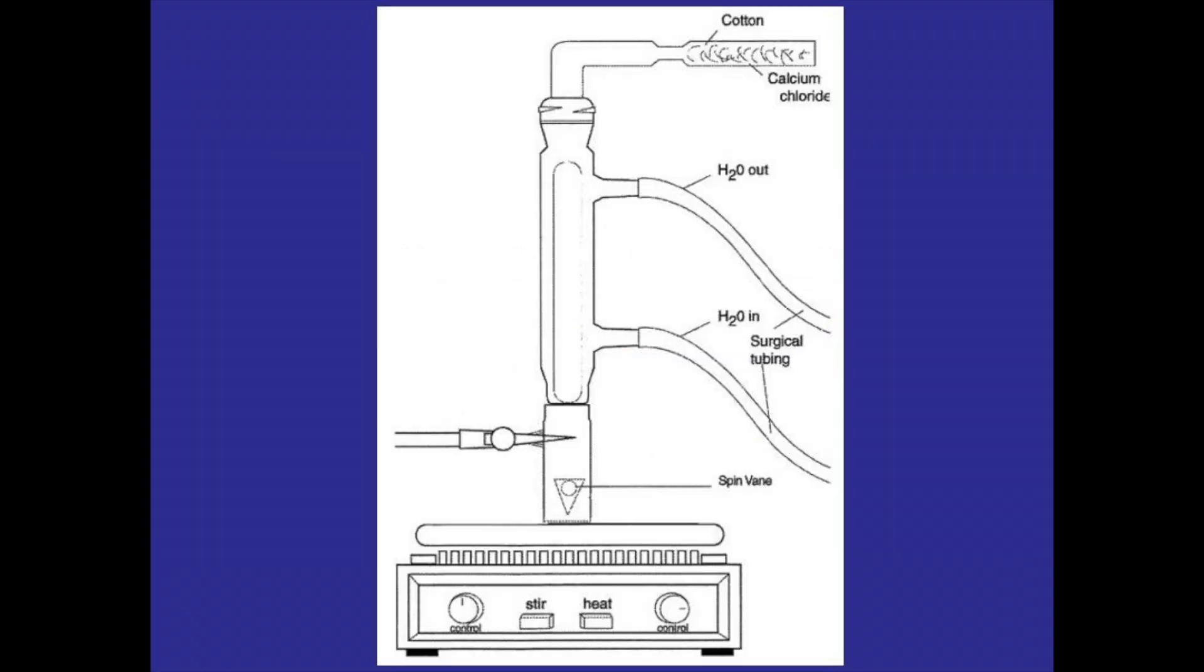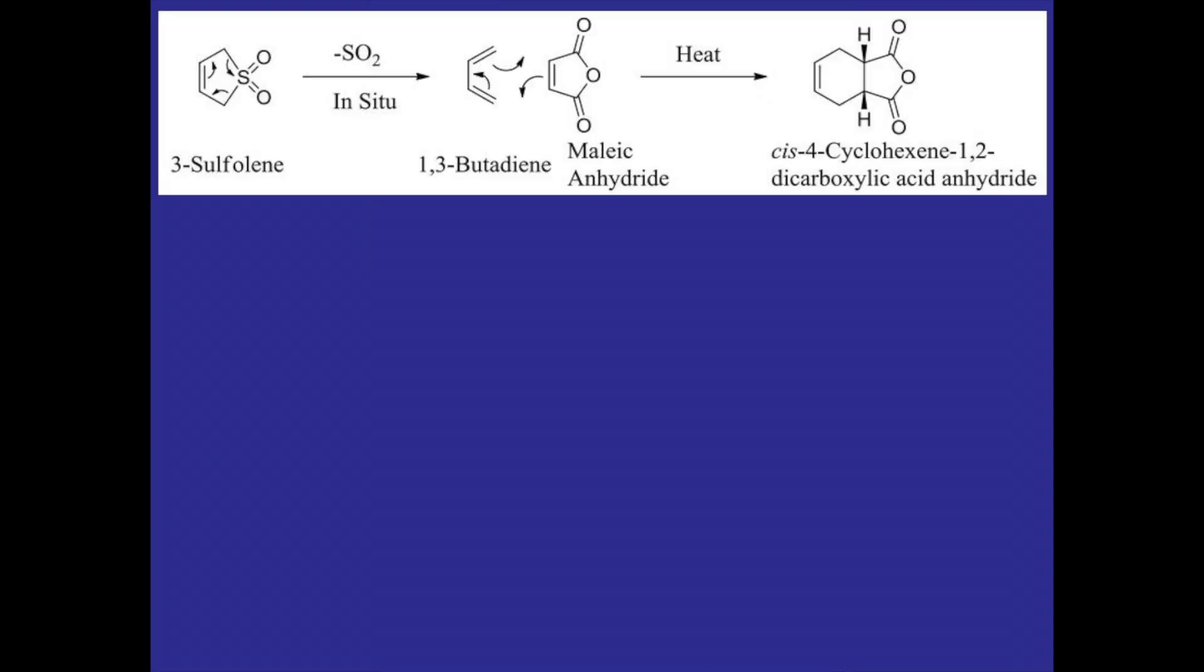So we can test the vapors coming off of the reaction by placing a pH paper moistened with some distilled water between the drying tube and the water condenser in the apparatus and it'll start turning a reddish pink indicating the presence of an acid. This helps confirm that 1,3-butadiene is being formed to react with the maleic anhydride.